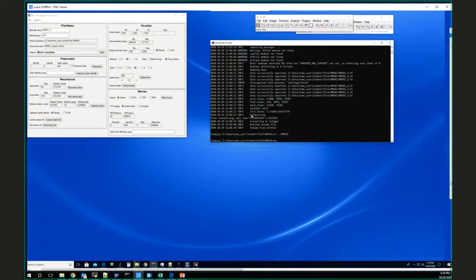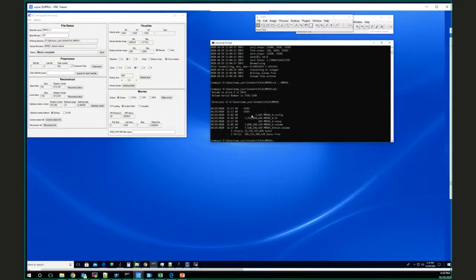So this Python software does the initial pre-processing. Ultimately, I'm going to use TomoPy for all the steps of this. This IDL program is older. I've been using it for many years, but I'm the only one who uses it, and I want to switch to TomoPy, which is a community effort. And its pre-processing is fine. Unfortunately, they've got a gridrec reconstruction, and so do I. I had it way before they did, and mine gives better reconstructions, and it nominally should be the same code. So I have to figure out why TomoPy reconstructions aren't as good as the ones I get with my IDL-based software. So for now, I'm still using the IDL-based software for the reconstructions and TomoPy for the pre-processing, because TomoPy is way faster for the pre-processing, and it knows how to read these HDF5 files, which my software doesn't know how to read right now. And may never, because I'd like to get rid of it.